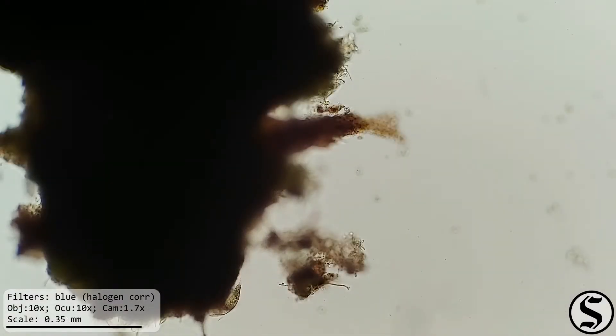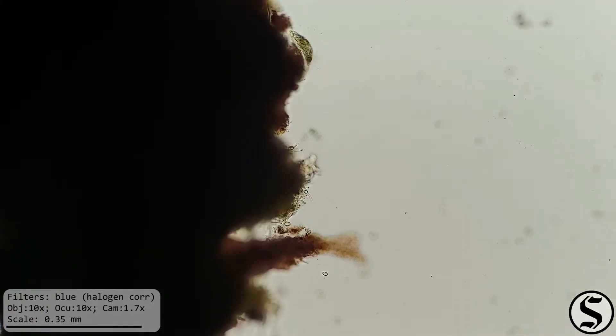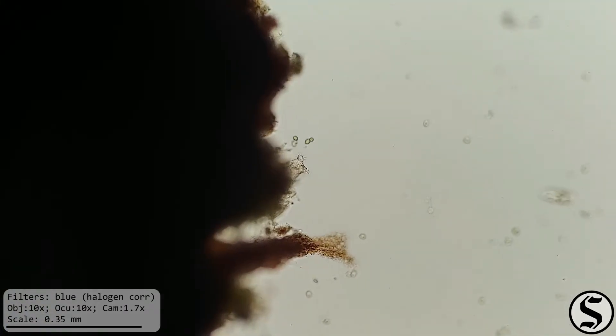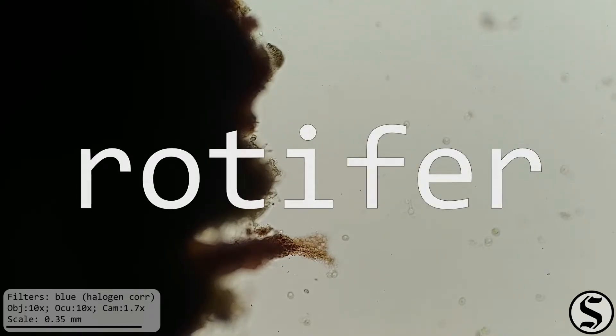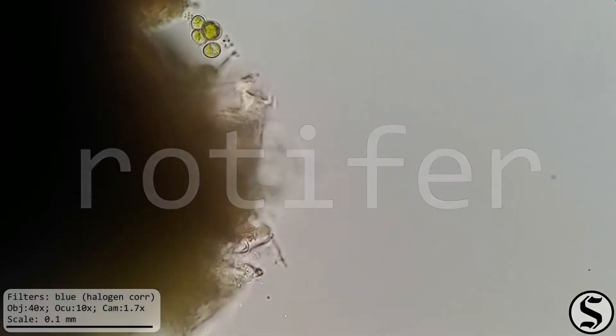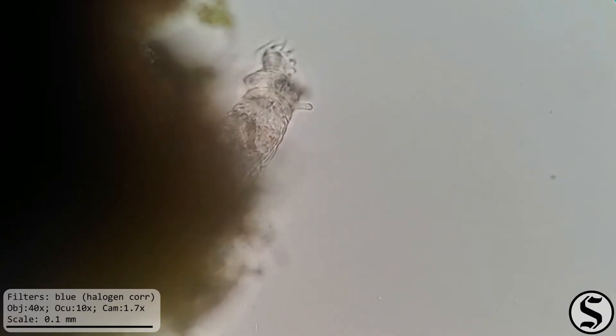So then I noticed over here some of those green algae really twirling around. As I brought things into focus, I noticed that we had a rotifer. That's an organism in the phylum Rotifera, which is Latin for wheel bearer from rota wheel, probably recognize that from words like rotate. This is kind of exciting. It's our first multi-cellular organism that we've seen in here.